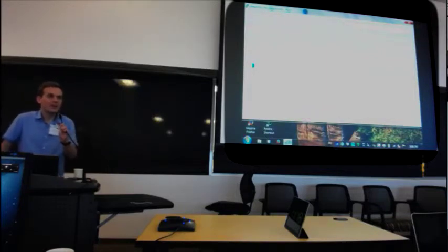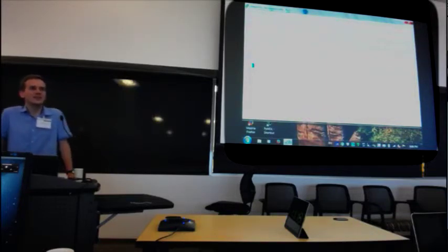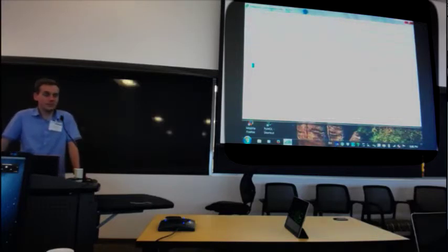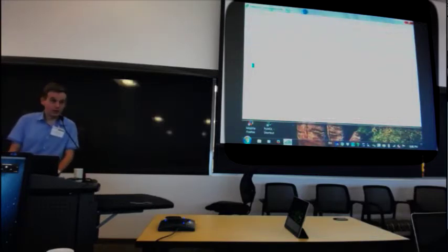Do you literally convert every frame? Don't say convert, it makes it sound like you convert every frame. No, we are doing hit finding. How do you tweak it? Exactly. So we have to tweak the hit finding parameters. We have to edit the ini file.